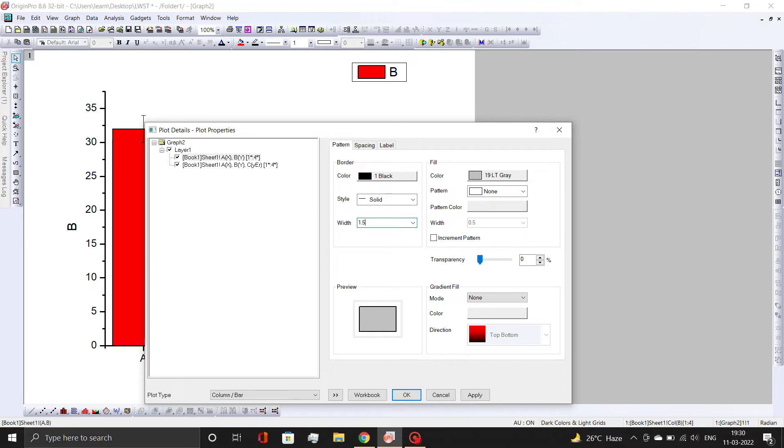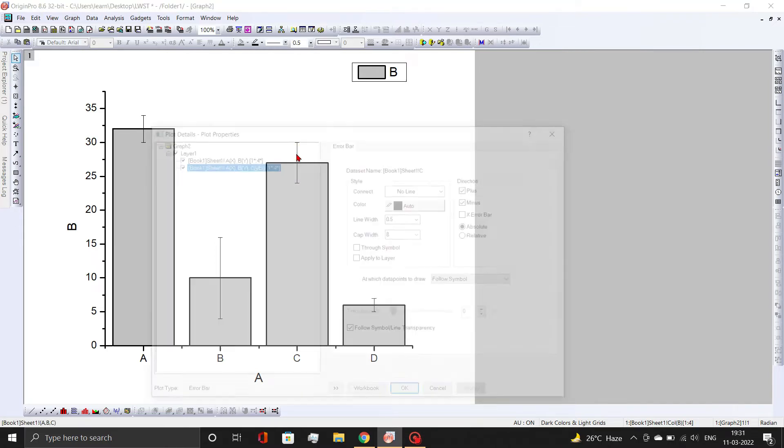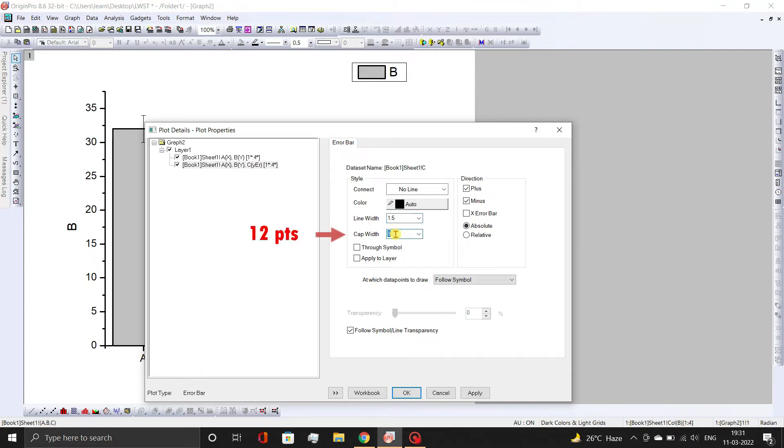Then, click OK button. Similarly, double-click on the error bars and change the line and cap width to 1.5 and 12 points respectively. Then, click OK button.